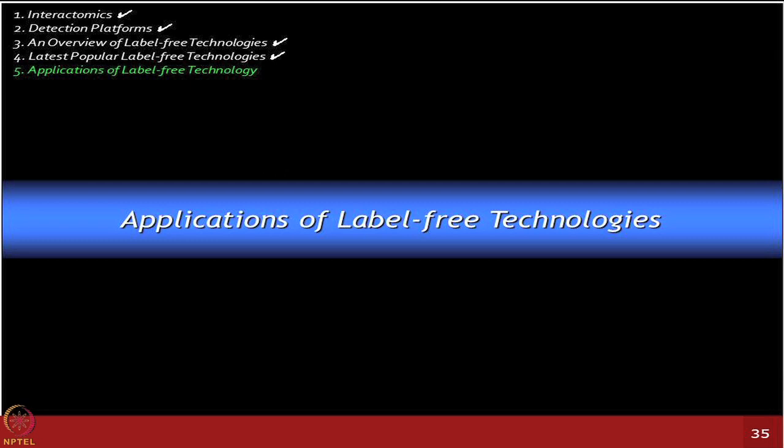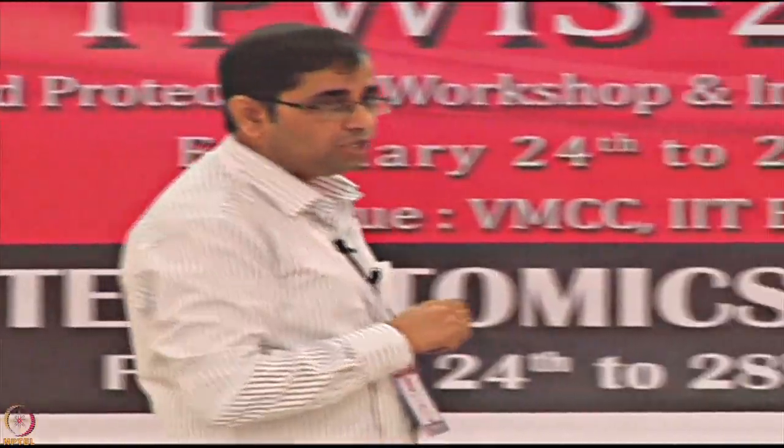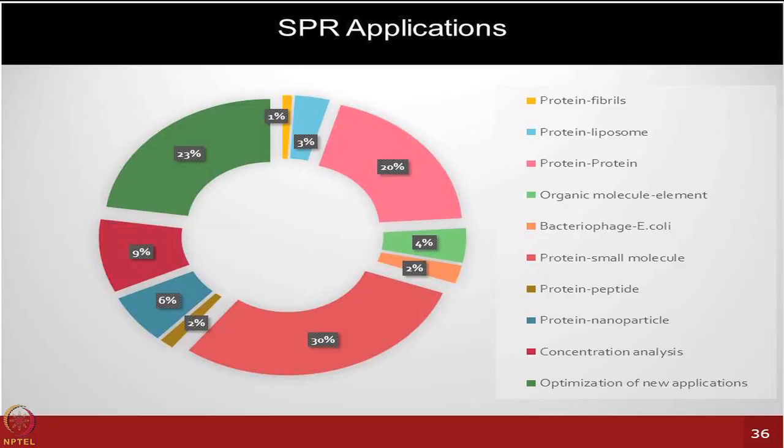I'm restricting the applications right now mainly to SPR, because that's what we currently have available at IIT Bombay. And I'm also running a core facility which offers services for many types of applications for internal and external users, and this is the distribution. What it shows you is that we are doing all kinds of applications here, from protein fibril interactions to protein liposomes and various organic molecules.